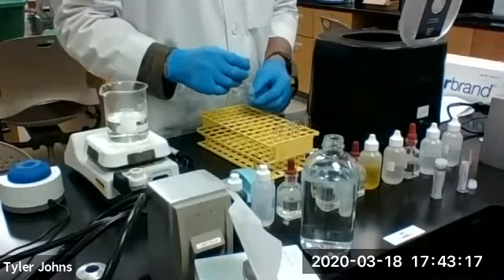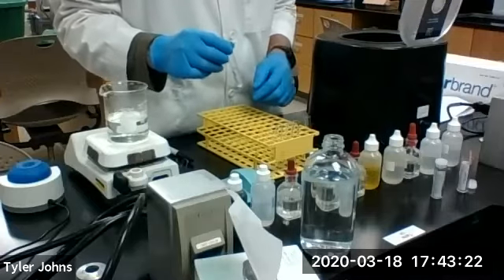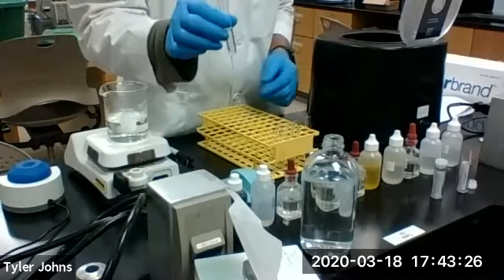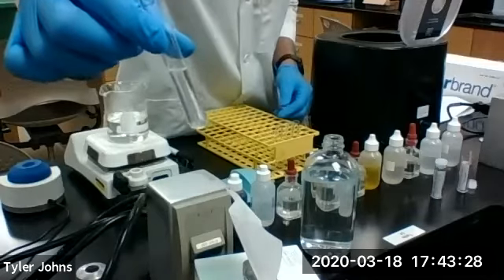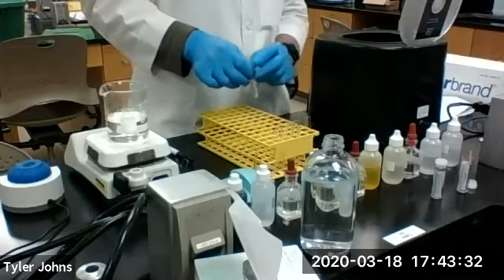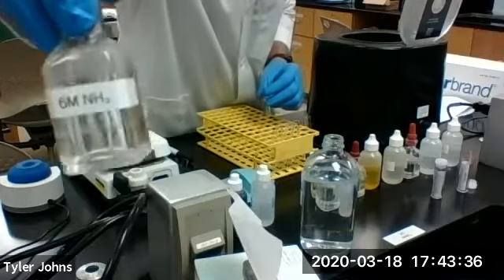Okay, to complete group 4, we are now going to be testing for the presence of magnesium ion. So we have S14, solution 14 from earlier. To S14, we're going to be adding 1 ml of 6 molar ammonia.